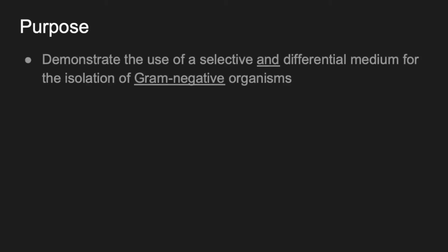What is the purpose of today's lab? We're going to demonstrate the use of a selective and differential medium for the isolation of gram-negative organisms. We've worked with different types of media in the past that were either selective or differential for different types of organisms, but I think this is the first one that we use that is both selective and differential.